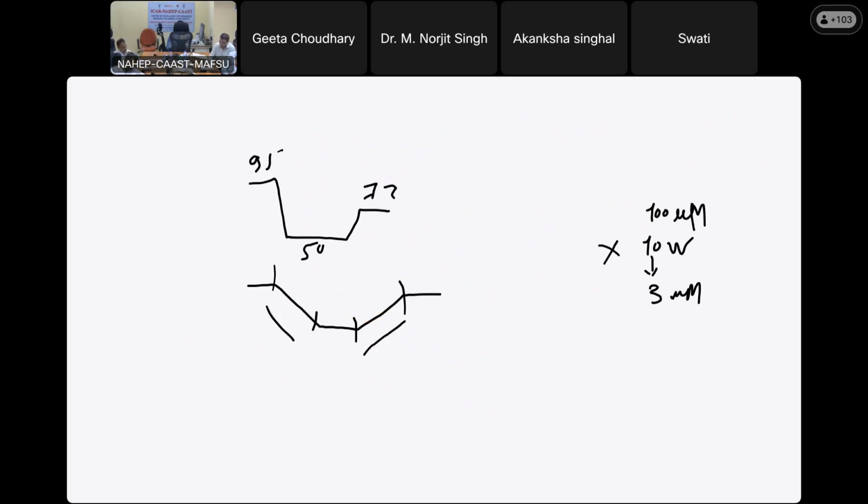Okay. Ramping is there. Yeah, all ramping is very slow. Okay. So you have to set your cycler for slower ramping. But most of the modern thermocyclers, you can change the ramping time and it is fine. So this is the main point.